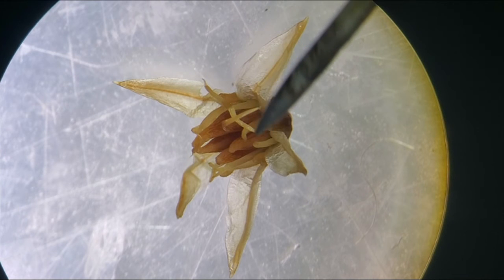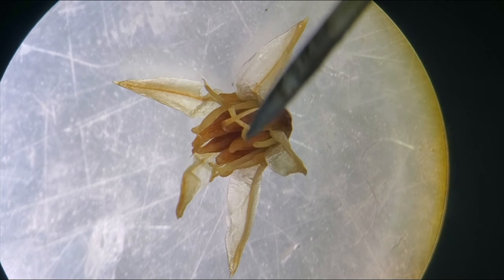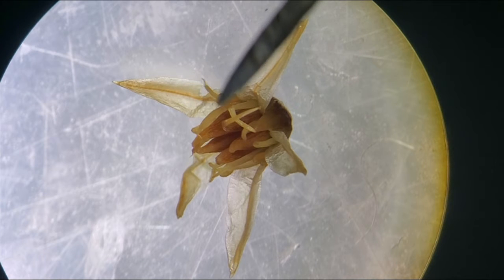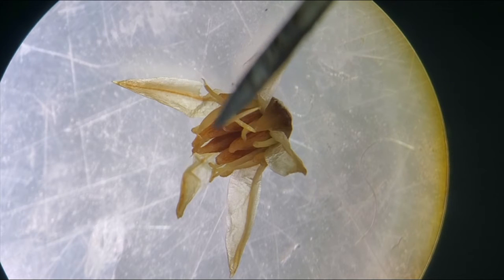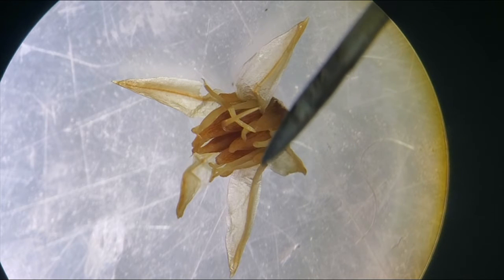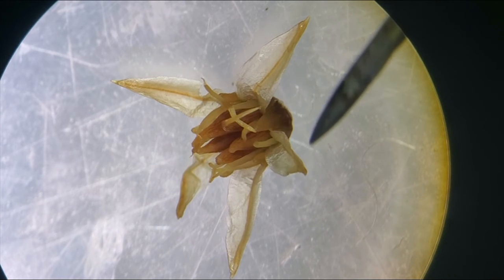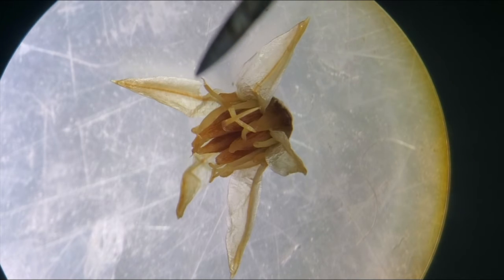The next whorl is the androecium, and here it's a little bit harder to identify because some of the anthers have fallen off, which happens from time to time, but we still have the filaments here, and we know that this is the floral whorl that's just inside the corolla. So we know that we have 1, 2, 3, 4, 5, 6, 7, 8. It's kind of hard to count here, but it looks like we have 8 stamens in the androecium.